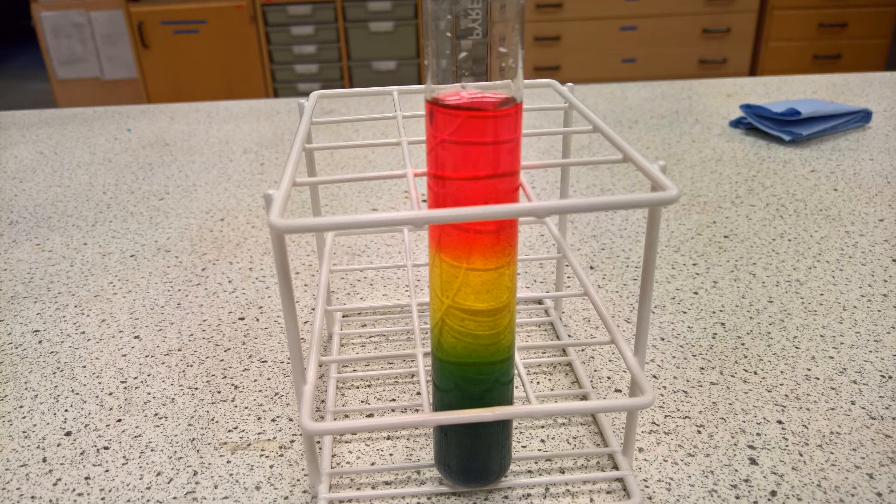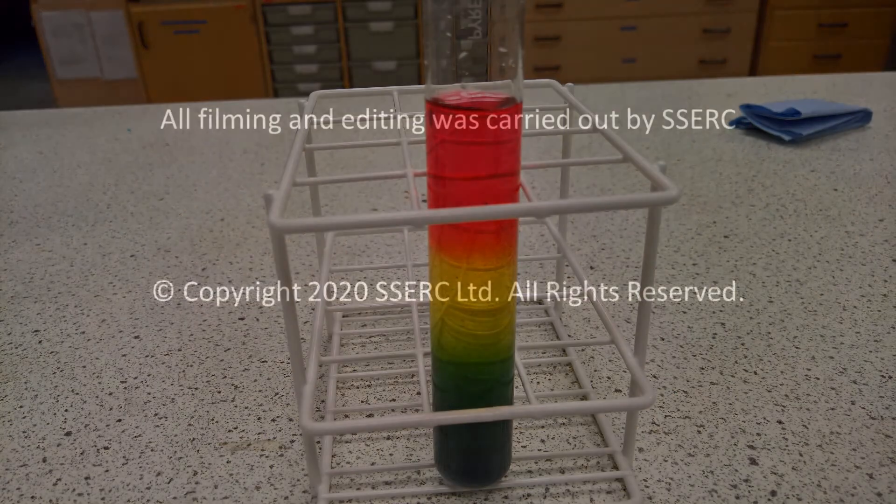The gradient will stay in place for an hour or more, and can be an attractive ornament in your laboratory.